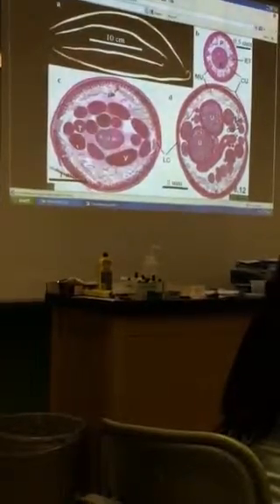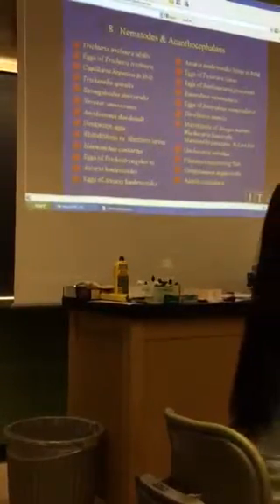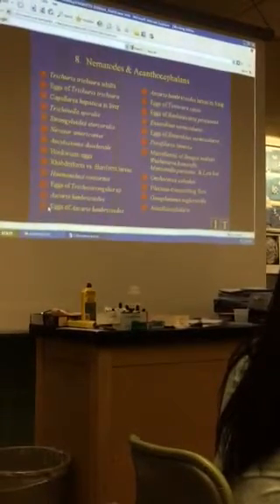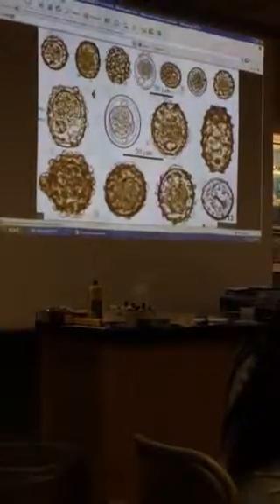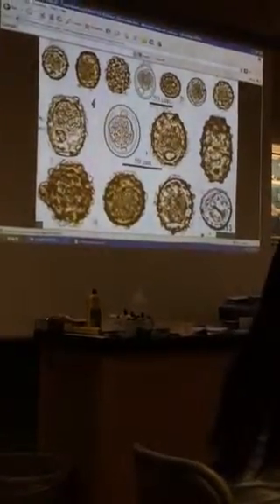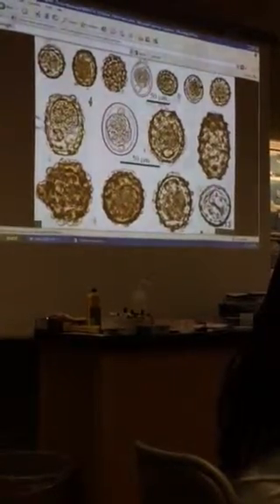Eggs to species. You have to recognize Ascaris eggs. Members of this family, their eggs look quite similar, but the only one we're going to have is the Ascaris lumbricoides or Ascaris suum egg. Either one is okay. We'll consider those kind of interchangeable. You may remember that we talked a little bit about how resistant these eggs are to the environment, but they have certainly a very characteristic appearance, especially since they have this extra fourth layer to the egg.